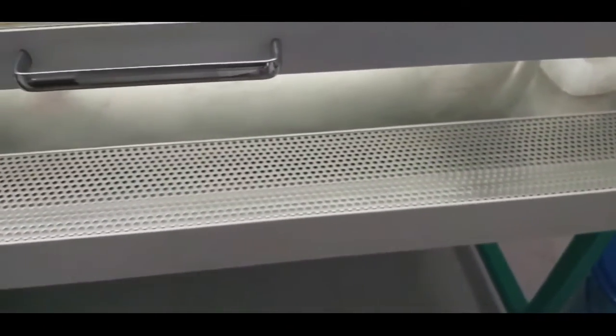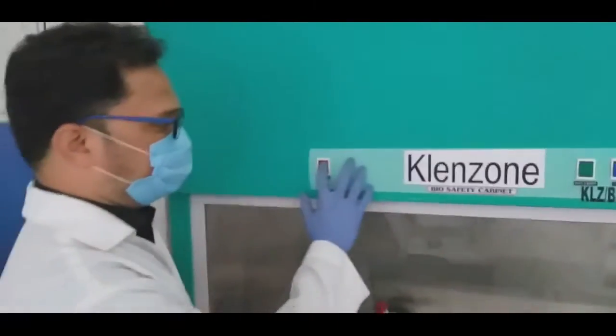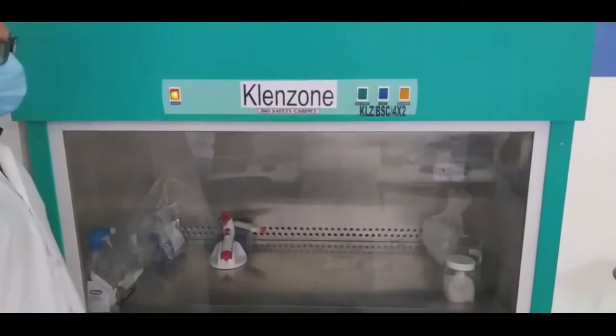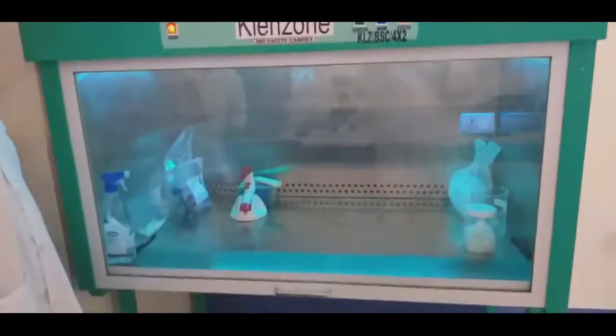In BSL-1, this provision for compressed air circulation is not there. Now we are going to start with animal tissue culture work, which is carried out in the Biosafety Cabinet. We have switched on the main switch of the Biosafety Cabinet. For surface sterilization, we have to switch on the ultraviolet light inside the cabinet for at least 20 minutes.